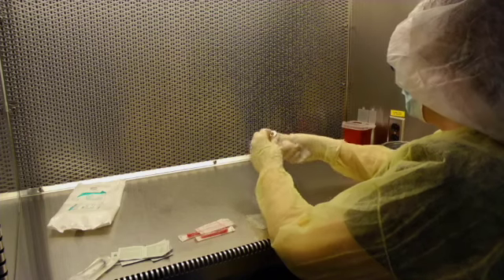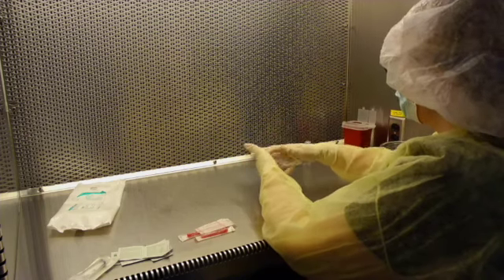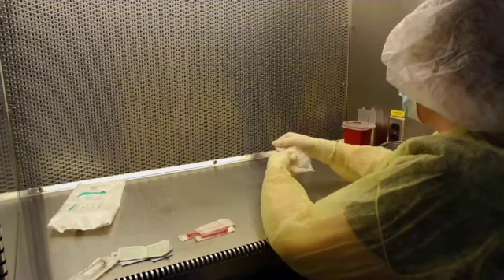Clean your sterile products into your designated compounding area. When preparing for a compound, remember you have an entire hood to compound in. You want to make sure that the area right in front of you is clear for compounding. So spread your products out so you don't have to worry about shadowing. Therefore, the first air can always reach our critical sites.